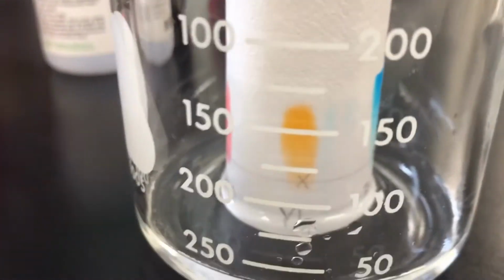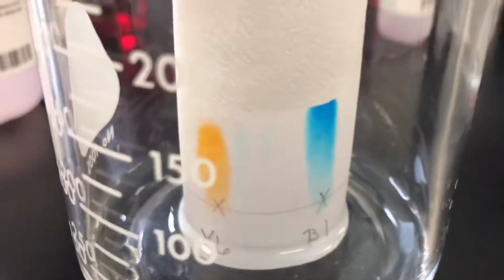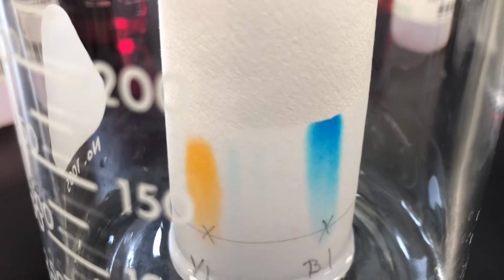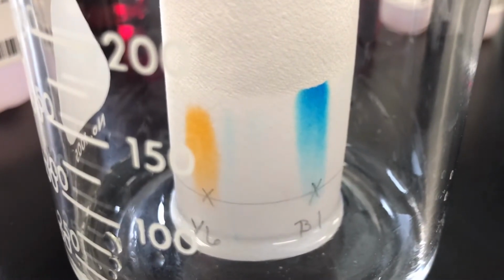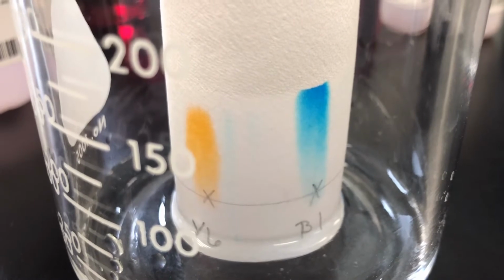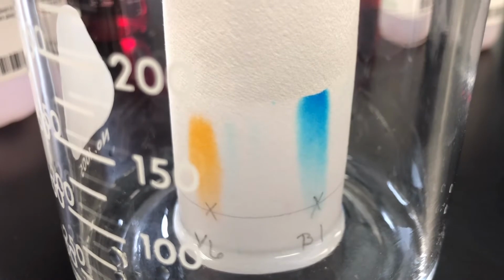Notice that some of that yellow number 6 isn't going quite as fast as the water, and so that makes a decent view for you. We're going to let this run for a little while, and then we'll let it dry, and then we'll start looking at some measurements. In the meantime, I will do the 4 different food colors over here.